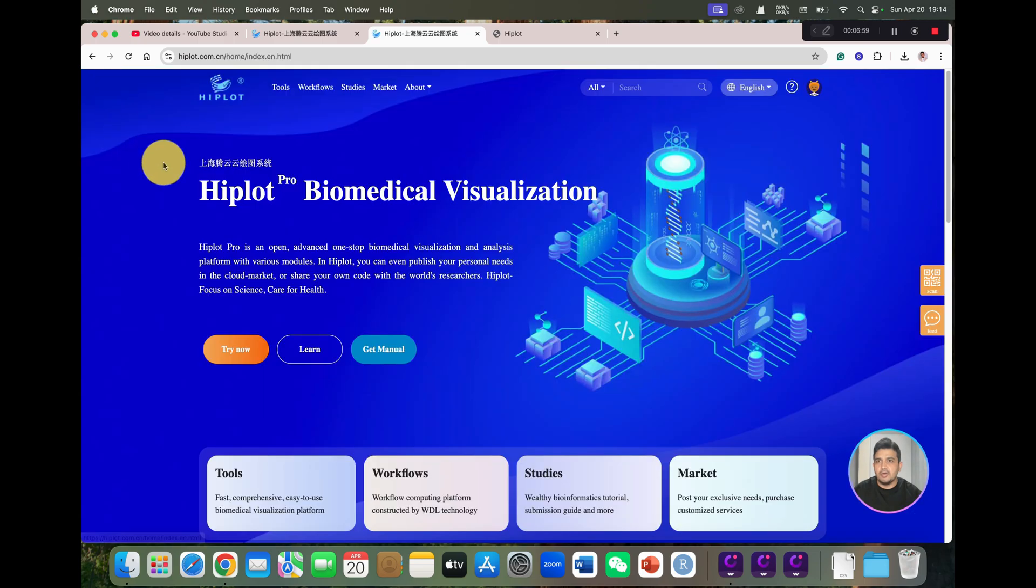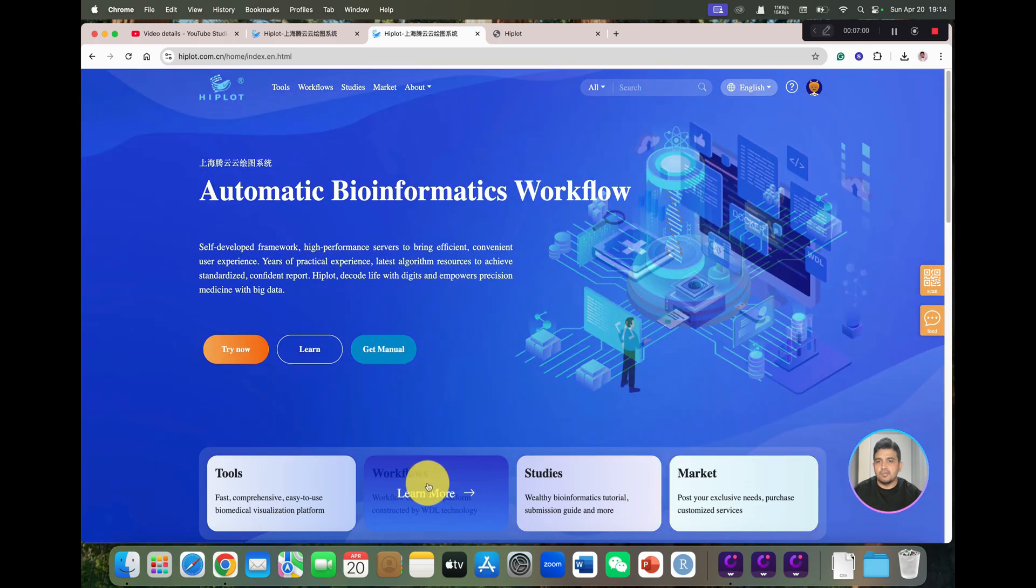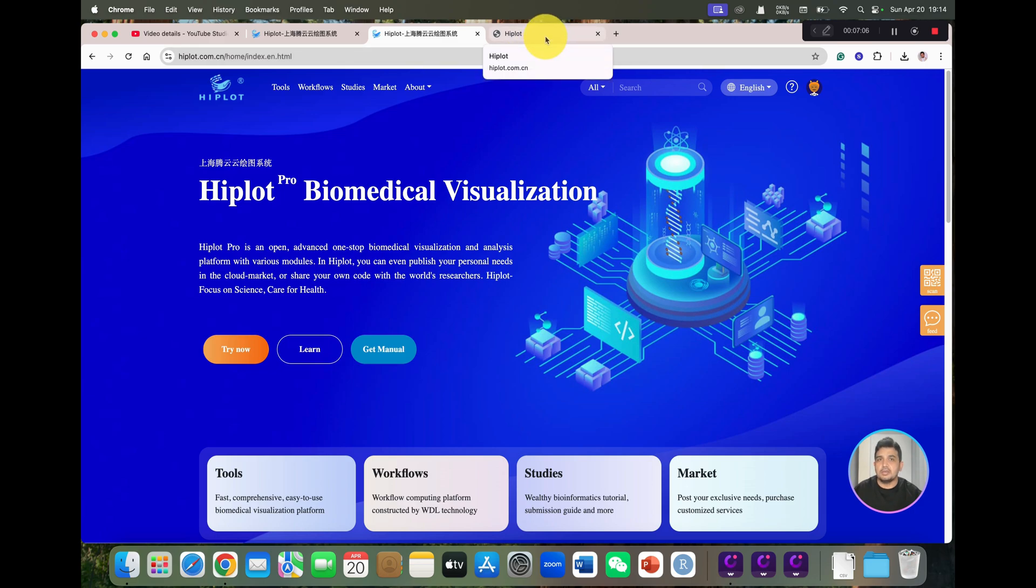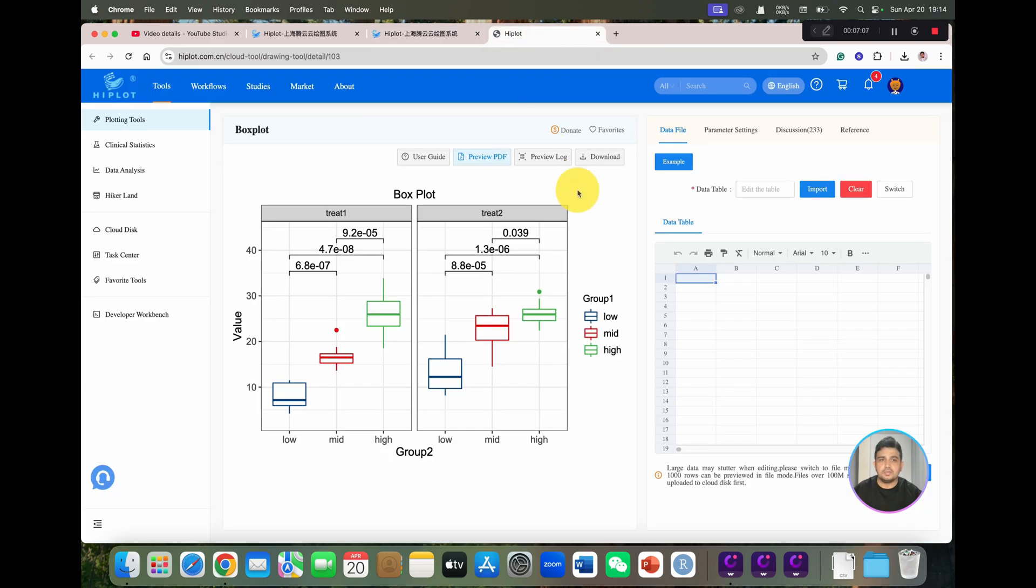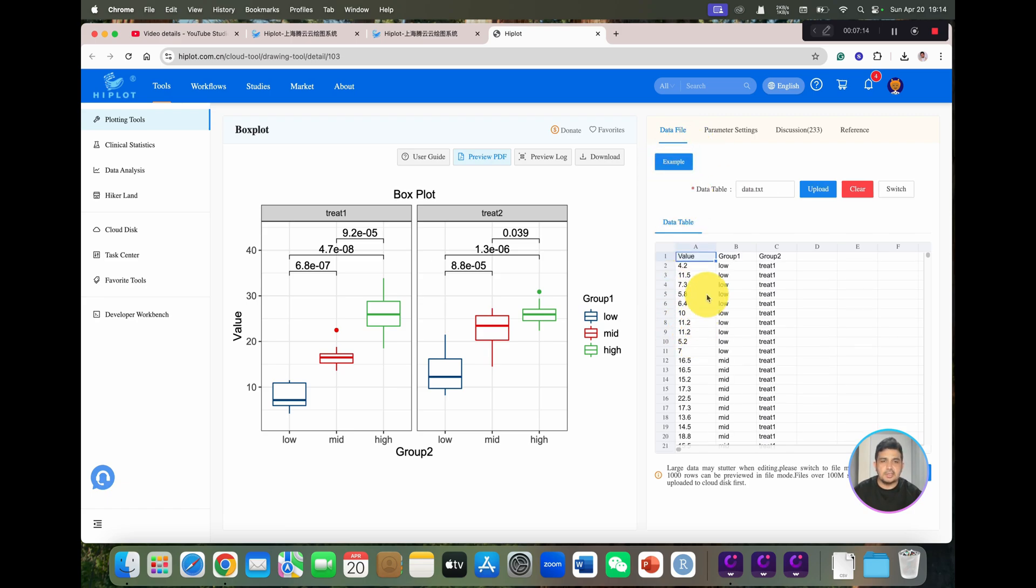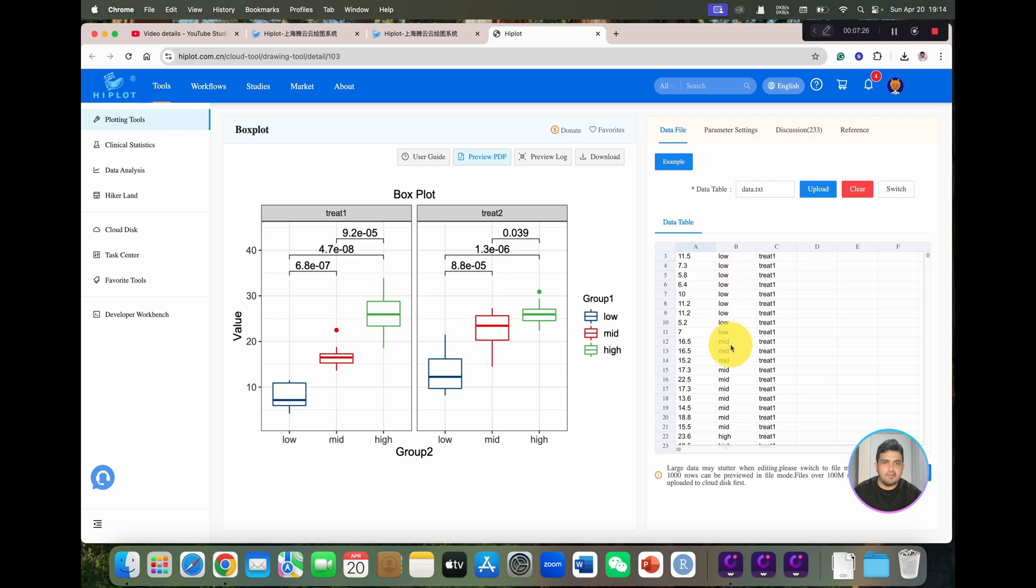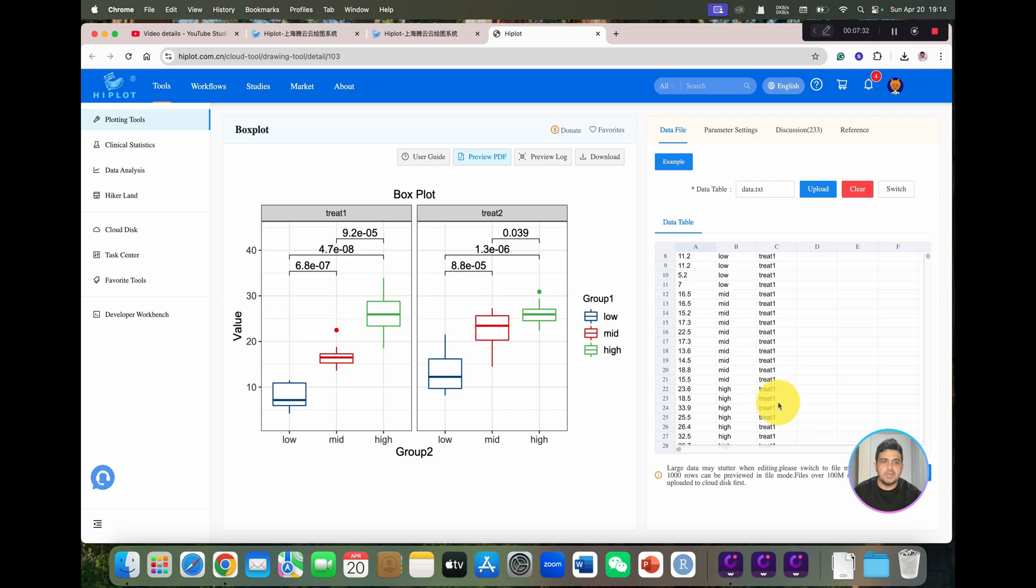Before we go into the workflow, I will show you how you can upload your data to this HiPlot and you can draw your own table. So you can see here we have the example. Once you click on the example, you see here you also need to prepare your data with values, then we have low group 1 and group 2. In group 1 you can see we have low, medium, high, and similarly for group 2 you can see we have the treatments.